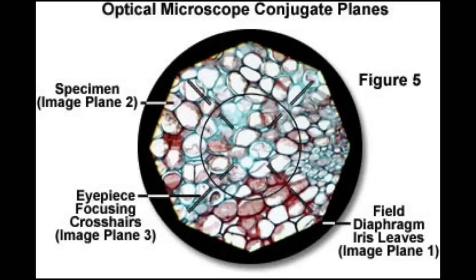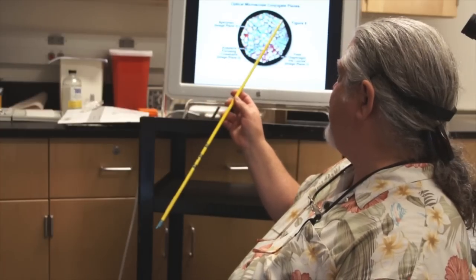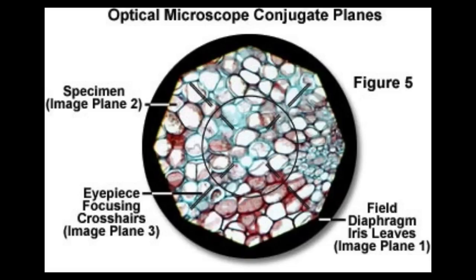Here you see your field of view, your specimen in focus, and the leaves of the field diaphragm centered to the field of view and highly in focus. In order to perform this alignment, you have to close your field diaphragm down until you see it in the field of view.